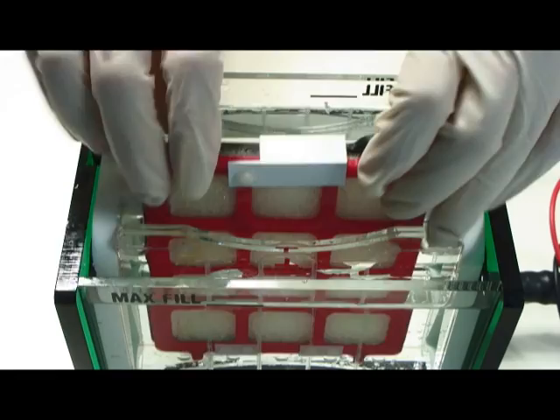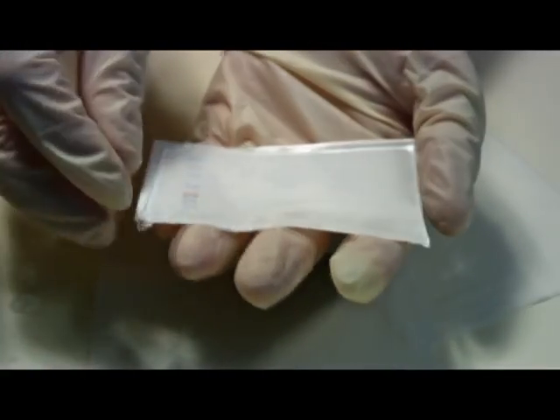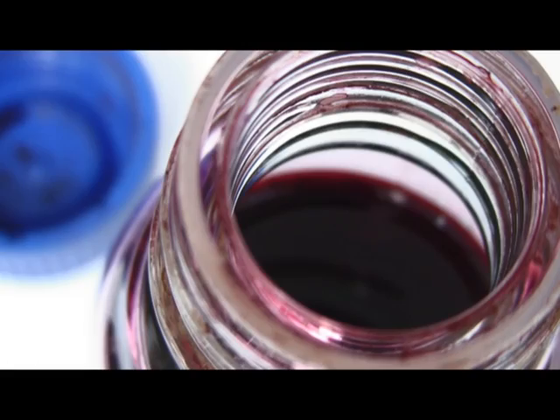Turn the power off and take out the sandwich from the chamber. Open the sandwich. Carefully grab the membrane. Transfer efficiency can be determined by staining the membrane with Ponceau red in the following way.